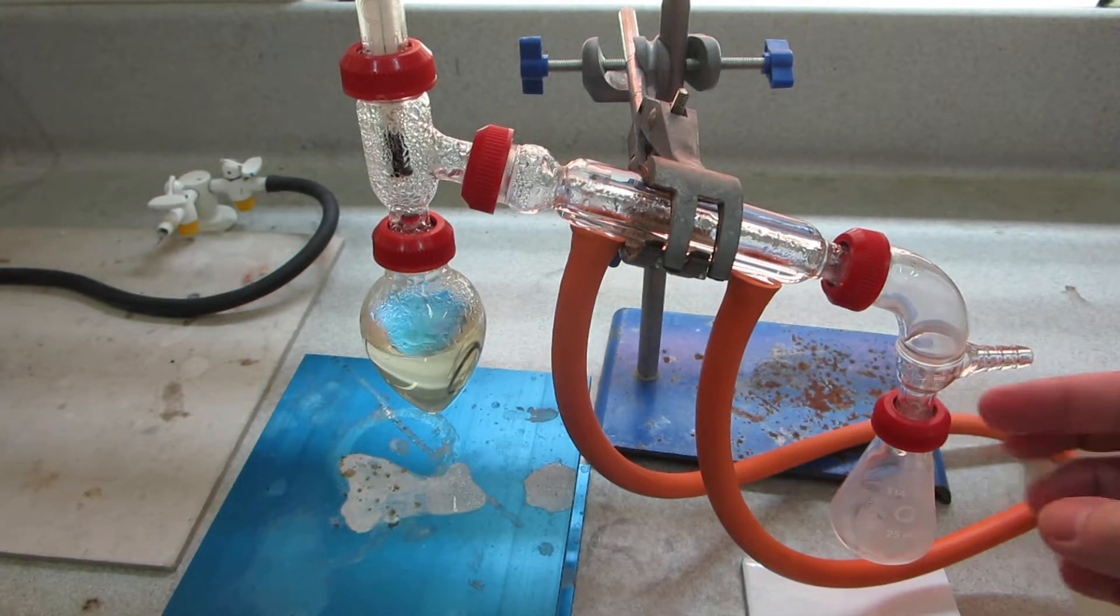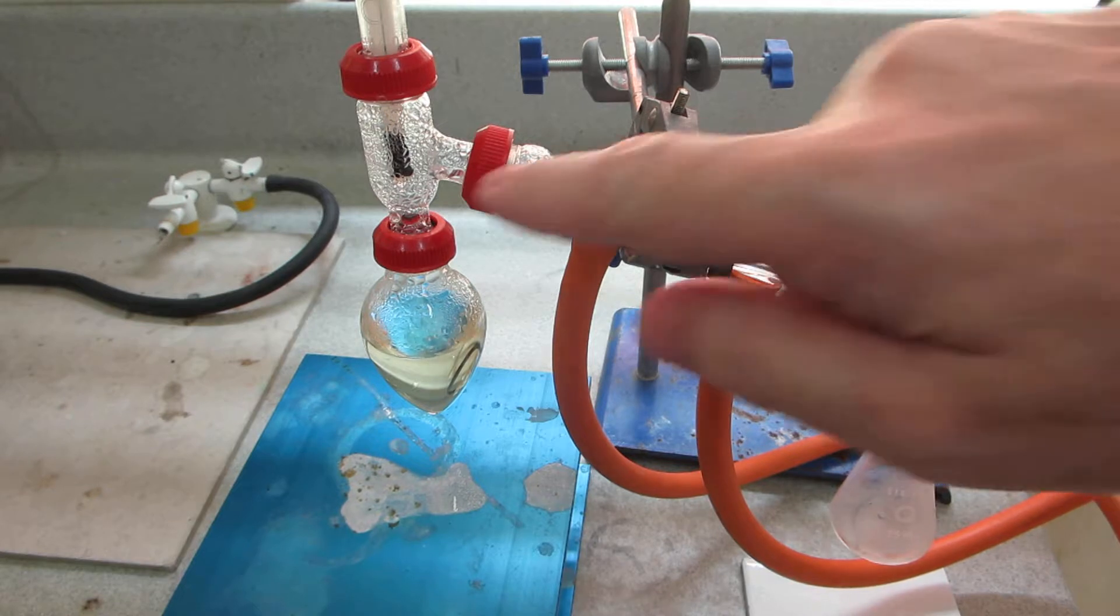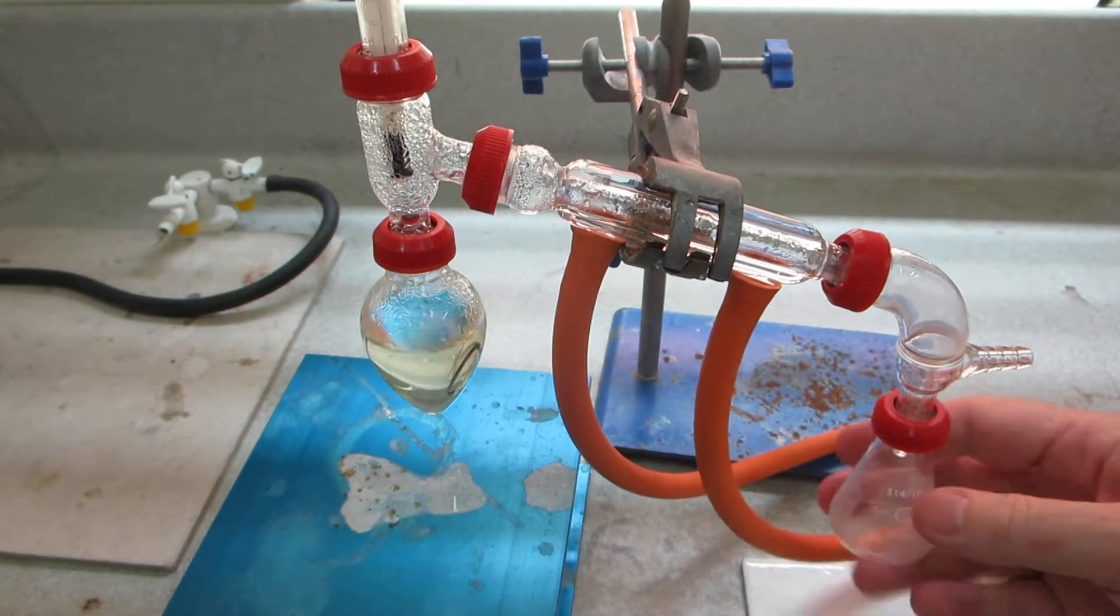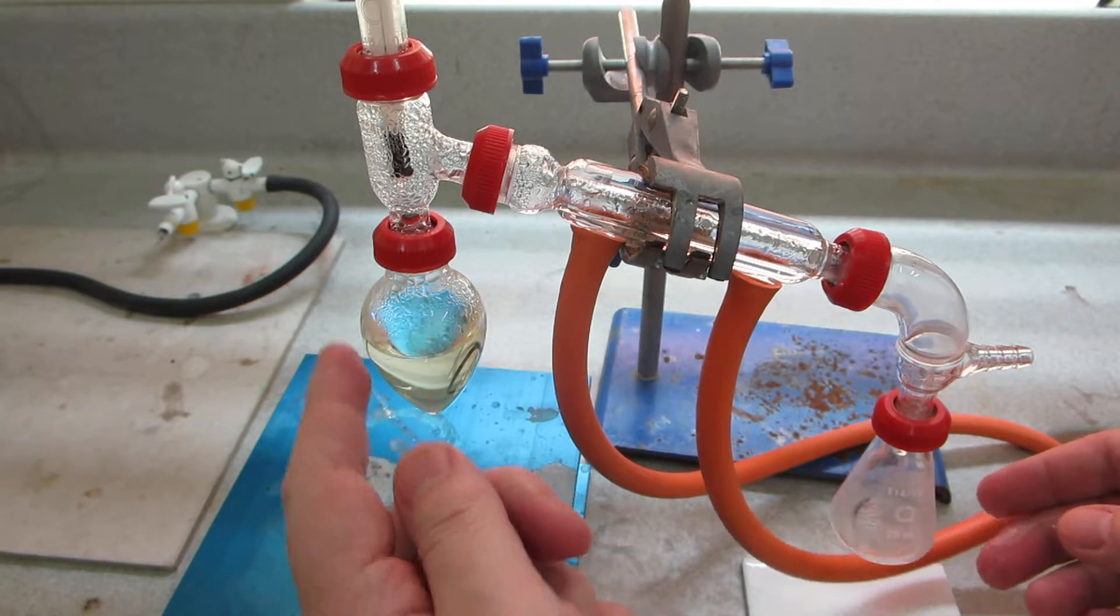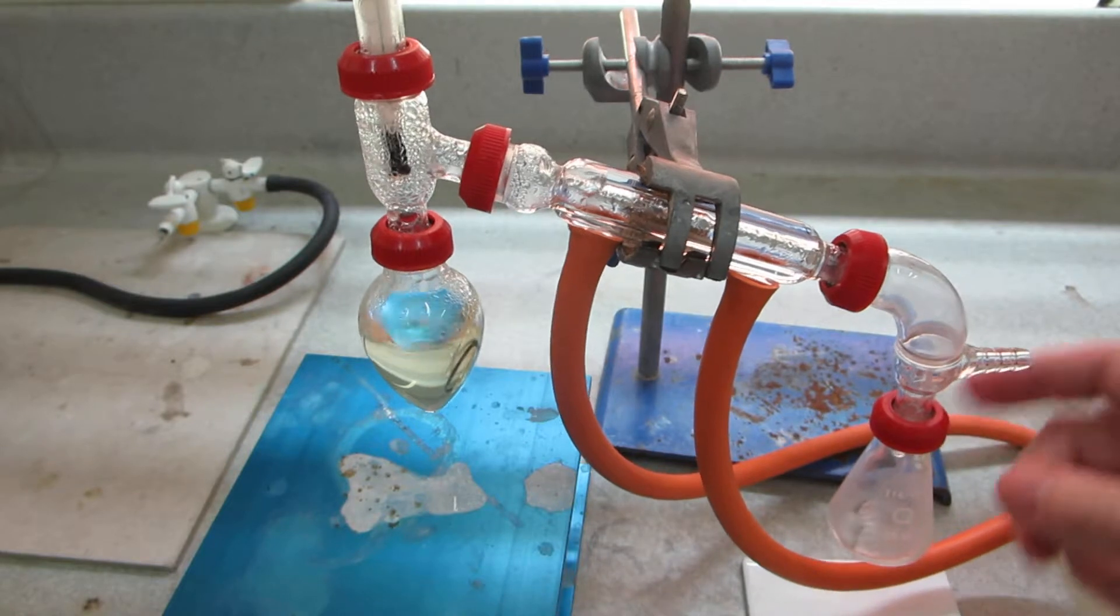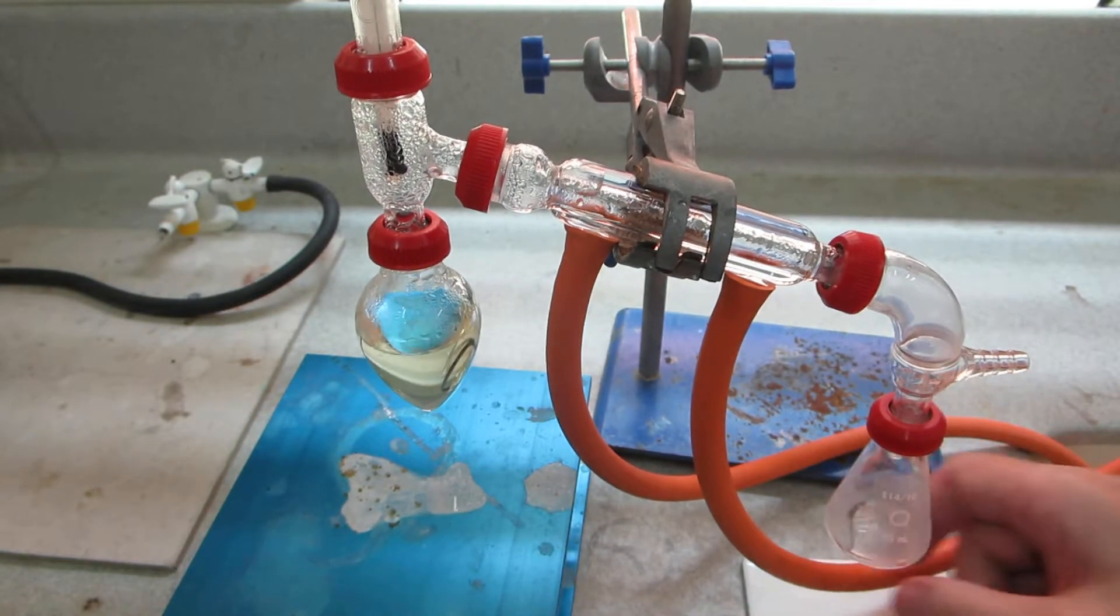Now there's a dilemma: do we heat this up further with a Bunsen burner and drive over more product, or do we take the material that's naturally condensed here with a few drops falling down there? So I think in this instance we'll take the product that's come over on the first take and we'll test that to see for the presence of an aldehyde.